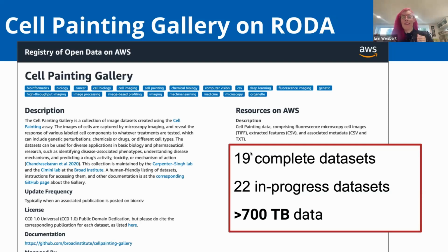And I also want to say that we welcome contributions. So most of the data is data that we have generated directly with a partner or collaborator. But now that the gallery is fully public, that is not universally true, and we absolutely welcome contributions of data. So if you have cell painting data that you or a collaborator are generating and would like to have made publicly available, again, drop me an email, let us know.